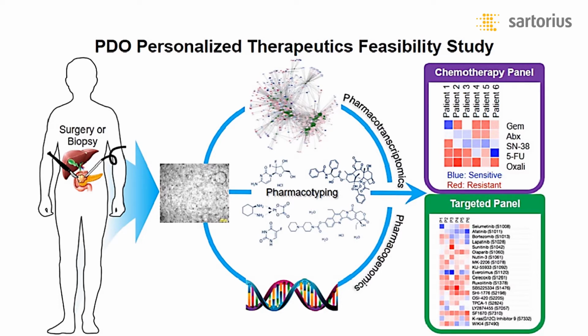We made the organoids, which is a picture you see next from the blue arrow, and then we analyzed them. Similar assessment to what you heard from Keith, and here's his cultures. So we, on the bottom, did nucleic acid analyses, looking for mutations in the DNA and expression of the mRNA.